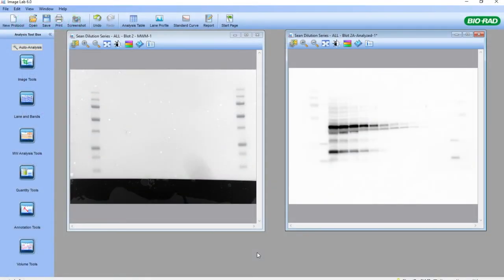Hello everyone, this is Sean Taylor, Field Application Scientist Manager for BioRad in Canada. This module will cover the molecular weight analysis tools, quantity tools, and annotation tools of ImageLab software.